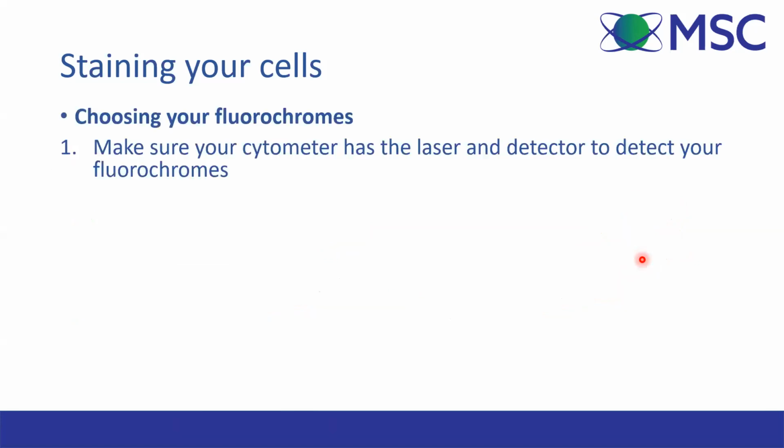So when choosing fluorochromes, there are a number of different parameters to take into account. You need to remember that each fluorochrome has distinct properties and it's characterized by specific excitation and emission wavelengths. So first, the fluorochrome must be excited by the lasers you have available on your instrument. And secondly, the emission wavelengths must be detected by the detectors or photomultiplier tubes on your instrument.